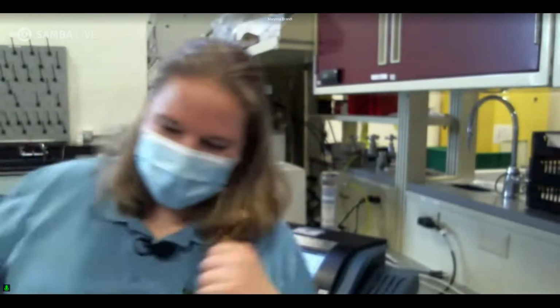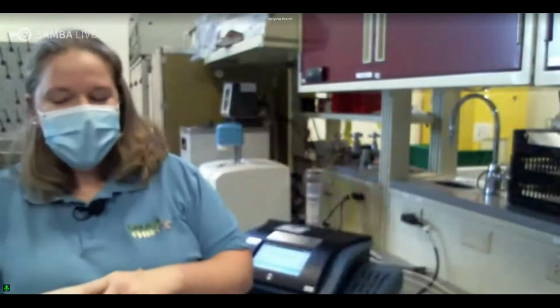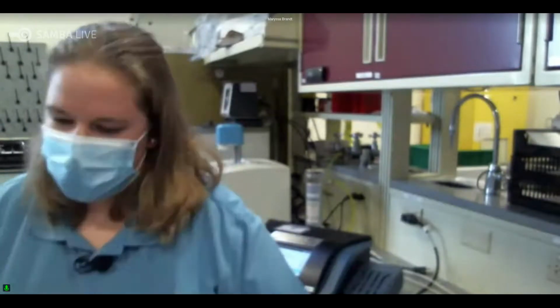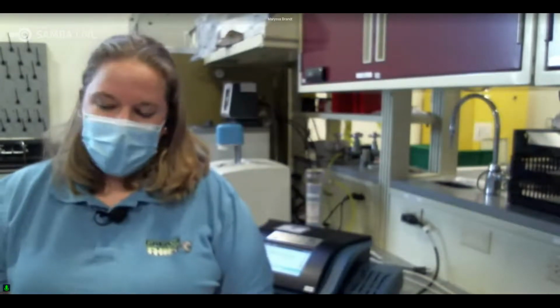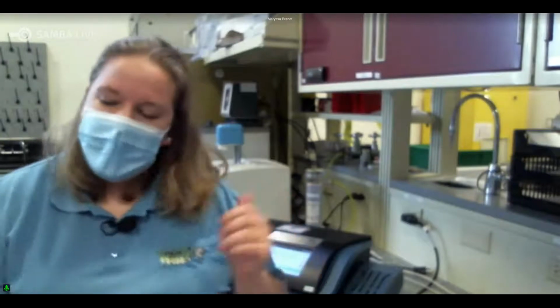And then the vials, we also put them on this rack, which is right behind me. And that's where our Vapor Pro vials go when they're done being washed. And they will sit there overnight. And then we will also put them in the oven sometimes to dry, if there's still moisture on them. You can also just take a lint-free wipe and wipe out the inside to help dry faster and let that sit overnight. So normally, if you just let it air dry like any other dish, it should be pretty moisture-free. And then the purge at the beginning of the test also helps eliminate any of that extra moisture as well.